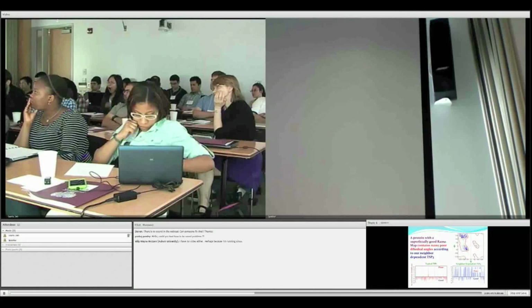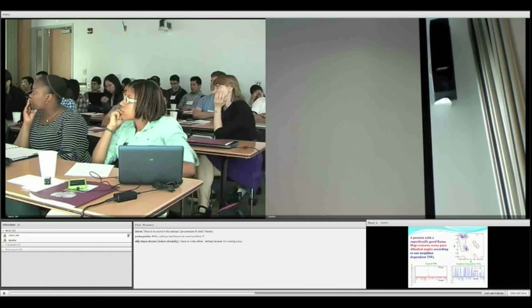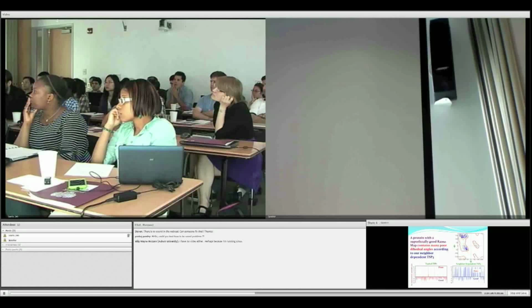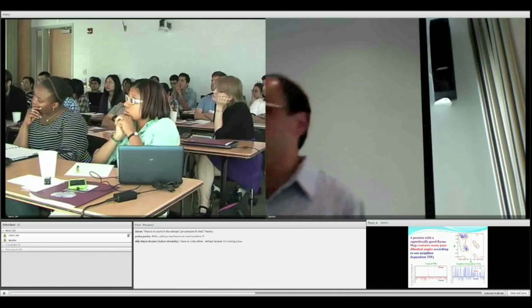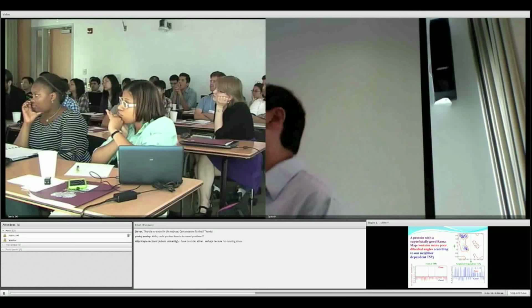So if you give this to an experimental crystallographer, pretty much they would say, okay, this is good enough. I have only 2 out, and this is very good for deposition into the PDB, and we can move on. However, if I score this with the TSP1, you can see that this is also good. TSP1 meaning that I consider only each specific amino acid's Rama. You can see that this is quite good with the TSP1 scoring function.